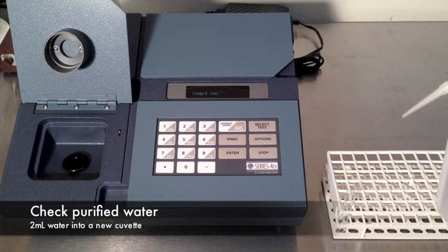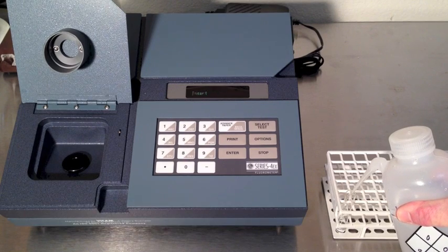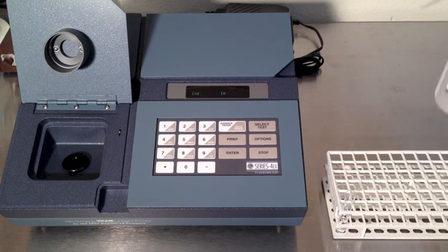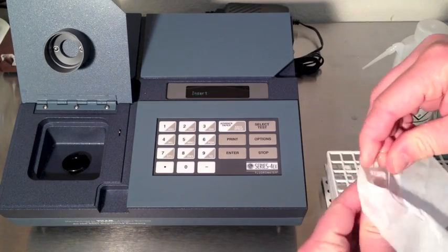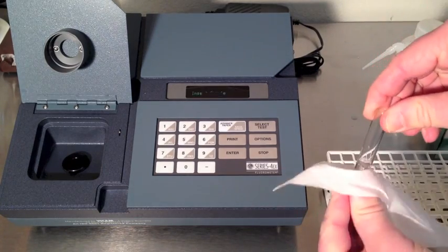Check your purified water. Fill a cuvette with two milliliters of purified water. Clean the cuvette with a wipe before inserting. Insert the sample and close the lid. In 60 seconds the display will show the results. Verify that the result is zero. If not, use a new supply of purified water.